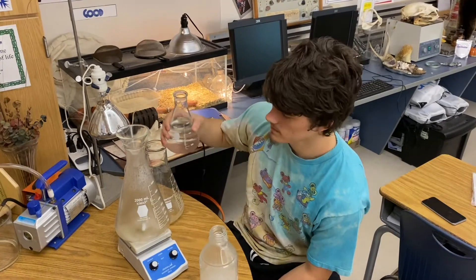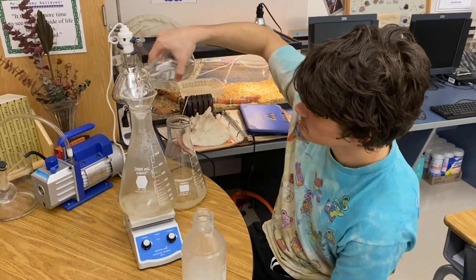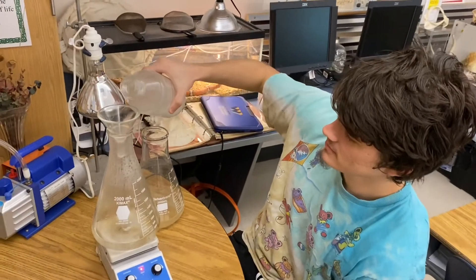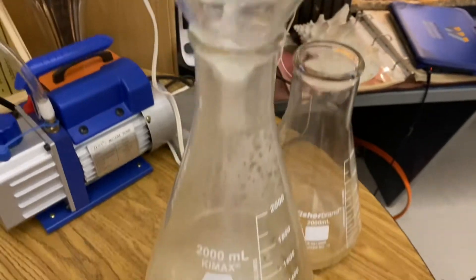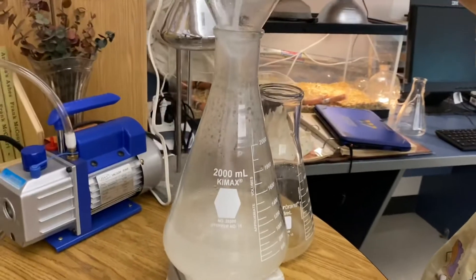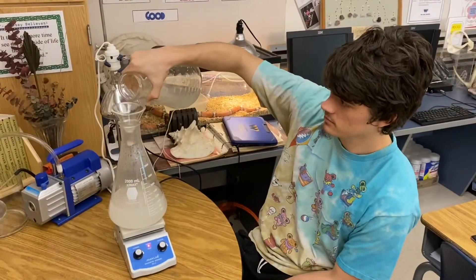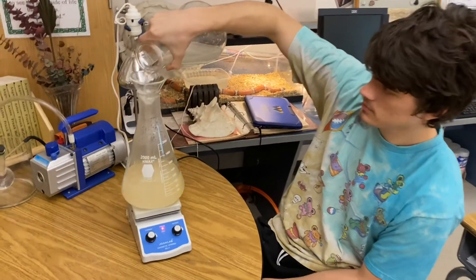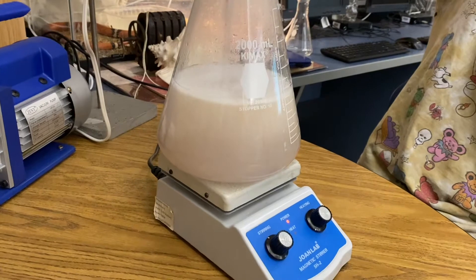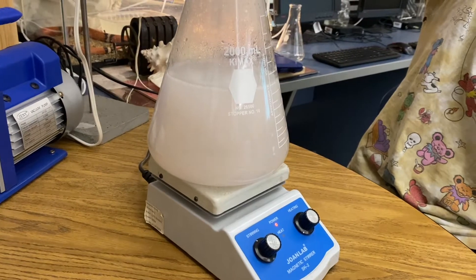Final moment — we're going to add solution A and B. Do not add solution C first. You have to mix A and B together before you add the hydrogen peroxide. Now we're going to add solution B. Notice that the solution is colorless — absolutely no color yet. Now it's turning yellow. Pour it all in there — now it's turning clear.